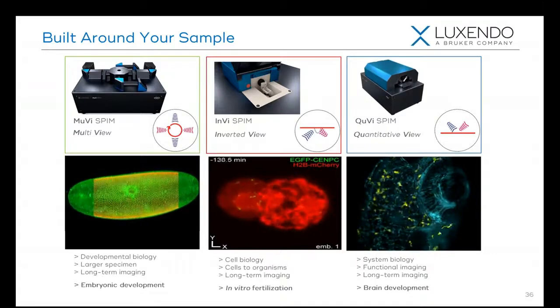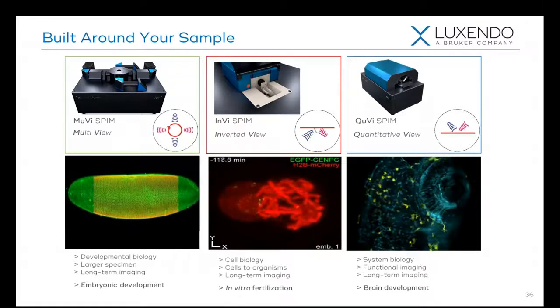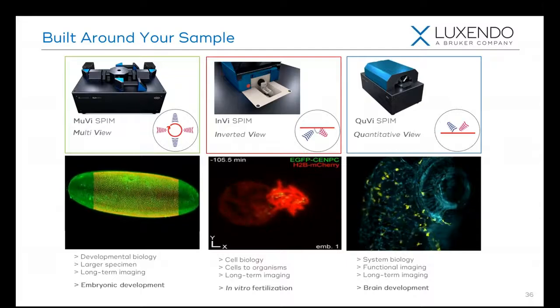And we've got one more question here. How difficult is it to prepare the sample for the InVi SPIM?